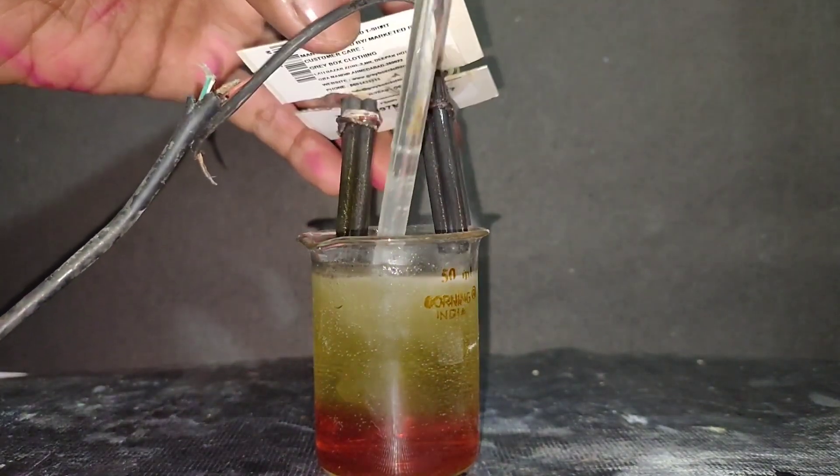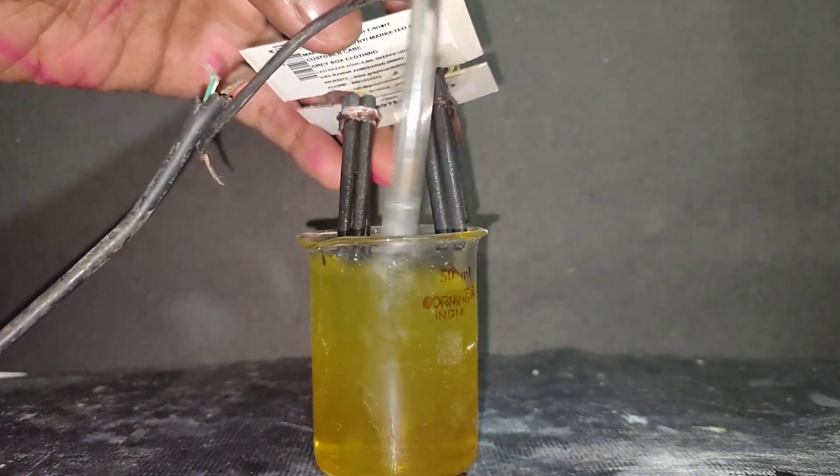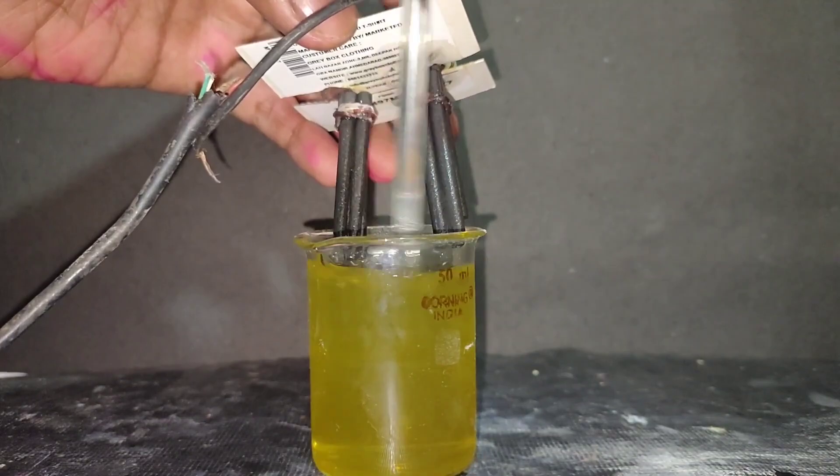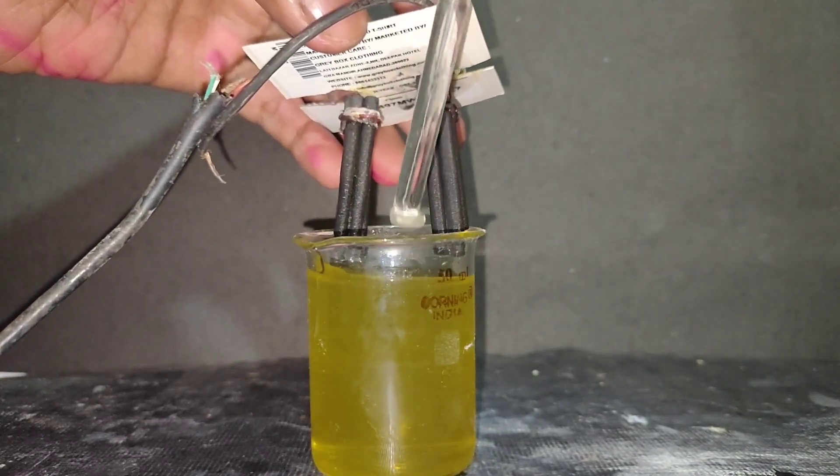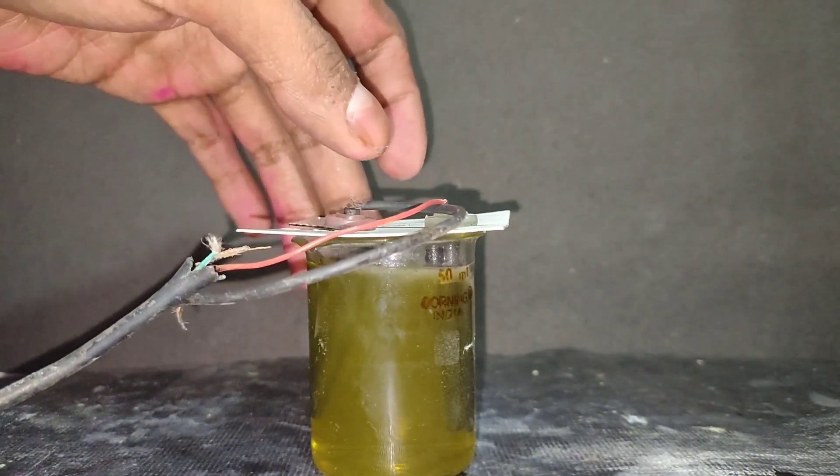As you can see here, bromine is formed and it settles in the bottom due to high density. When I stirred the solution, the orange color of bromine disappears because it reacts with potassium hydroxide which is formed in this reaction to form potassium hypobromite.